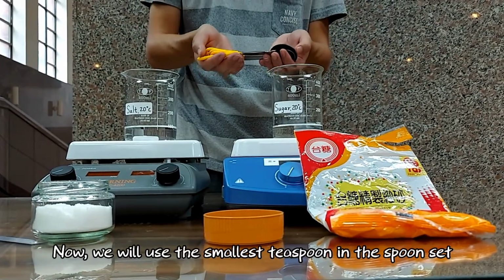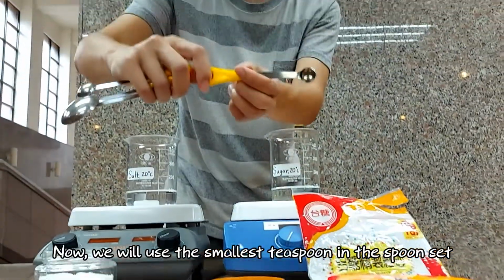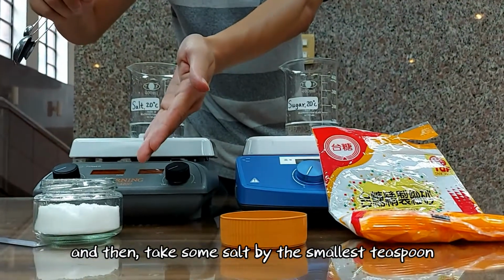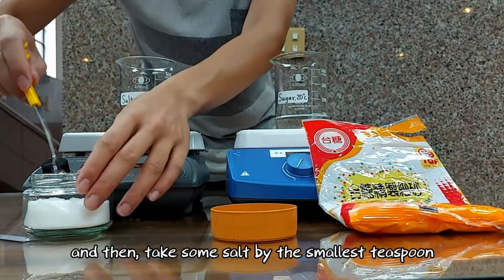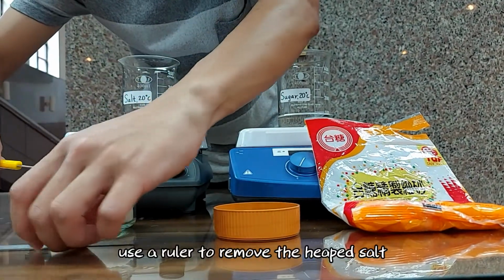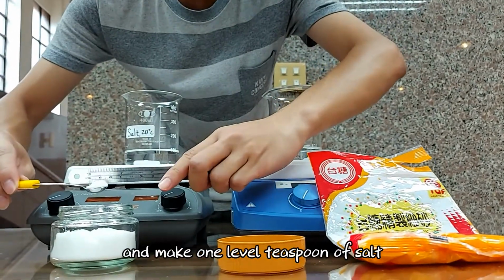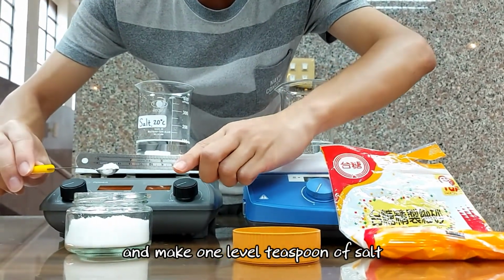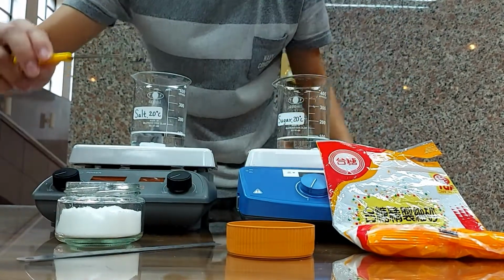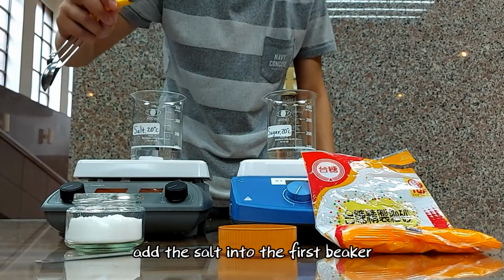Now, we will use the smallest teaspoon in the spoon set. And then, take some salt by the smallest teaspoon. Use a ruler to remove the heaped salt and make a 1 level teaspoon of salt. Add the salt into the first beaker.